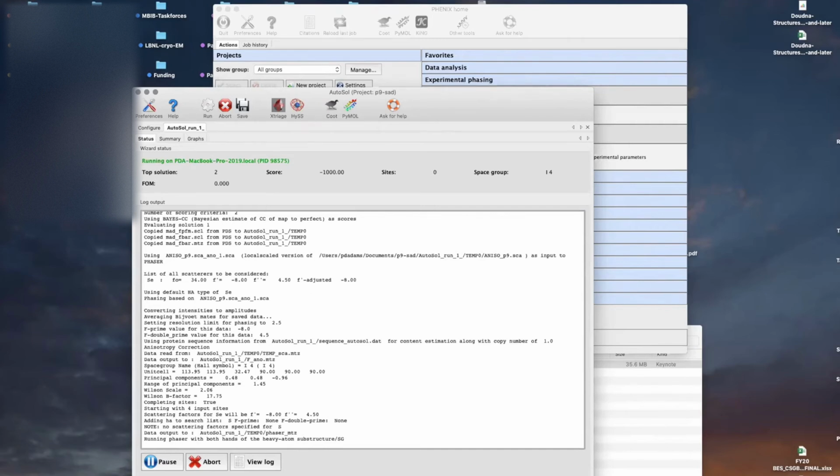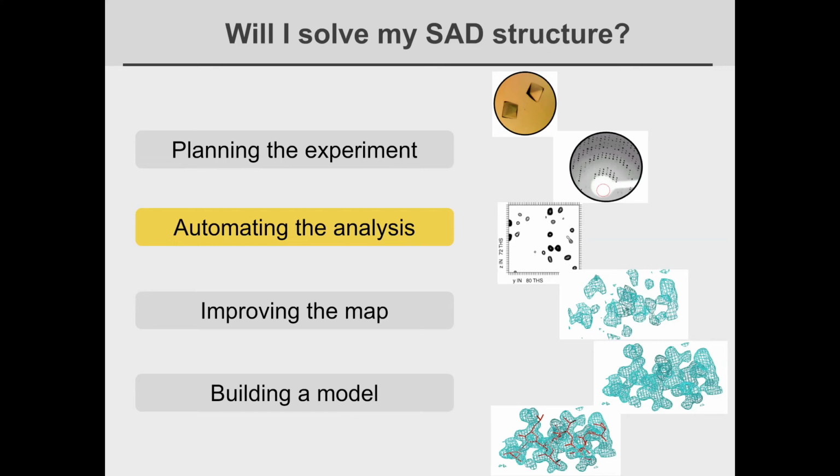We'll come back to this. So there are some questions as well. Let's hit those first. Somebody asked what NCS copies. Yeah, I think I got that one. Okay. Can you explain a bit more about what data accuracy means?